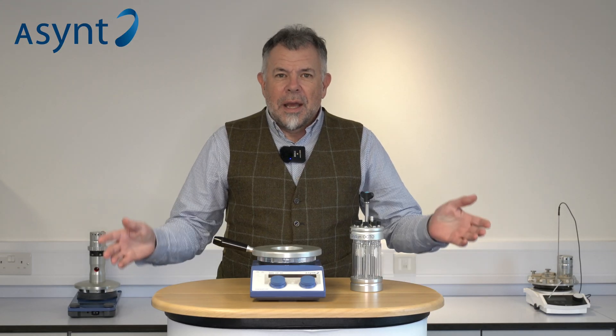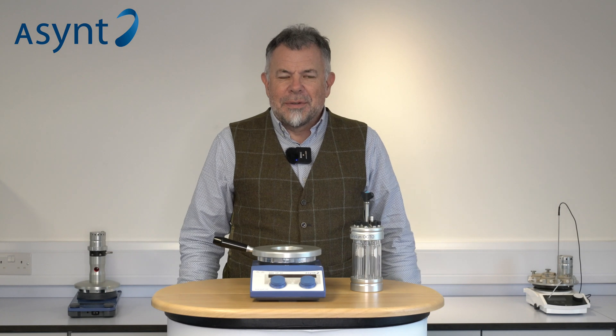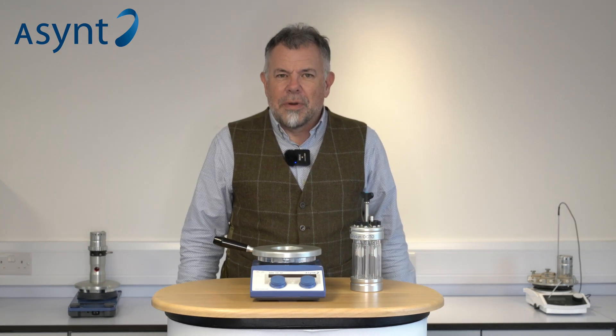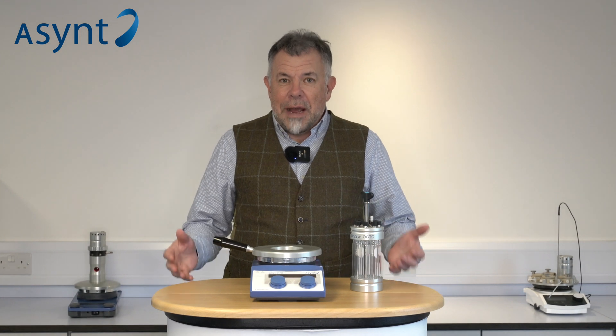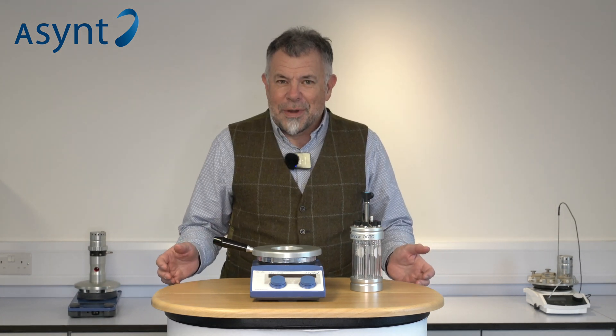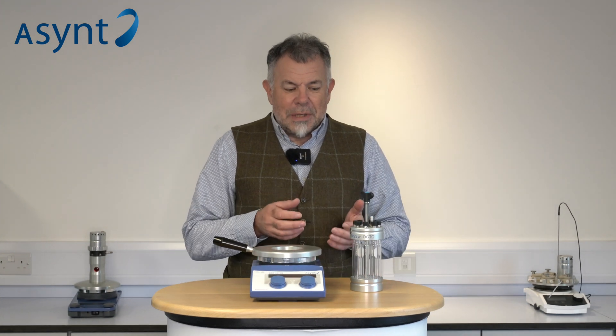Welcome to Asynt. I'd like to tell you today about photochemistry and one of the exciting new products we have at Asynt — a parallel photo reactor designed in conjunction with our customers. Let's tell you all about it.